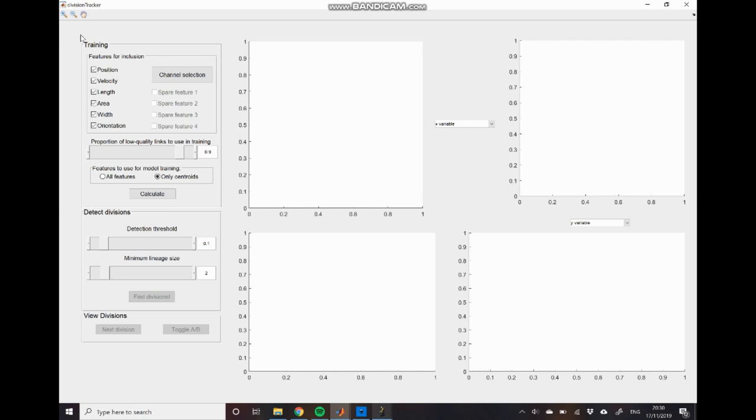And so we'll be performing all of our validation on the entire data set rather than on two different data points as we're doing in the previous GUI. The third difference is that we introduce a new variable which is the distance in time between the end of the maternal track and the start of the daughter track. This allows us to account for those occasions which we saw in the previous video where the mother cell track overlaps somewhat with that of the daughters.